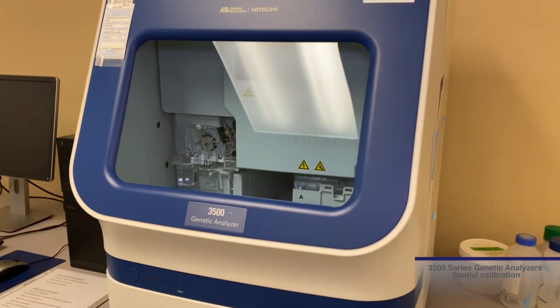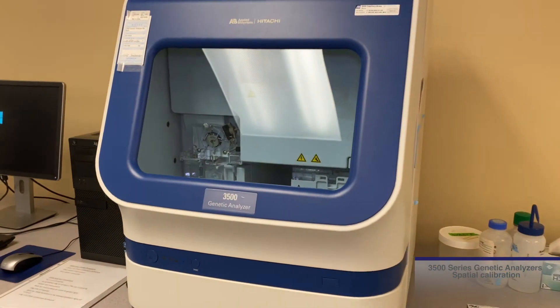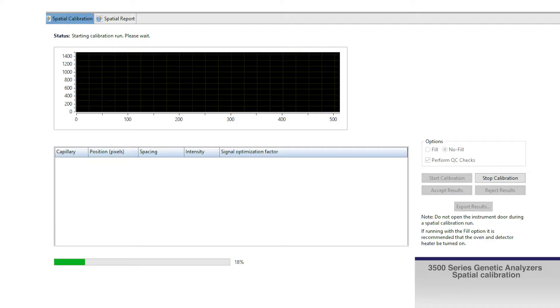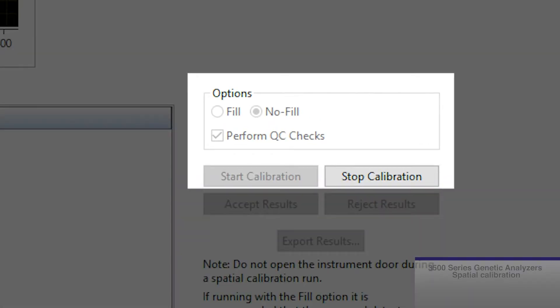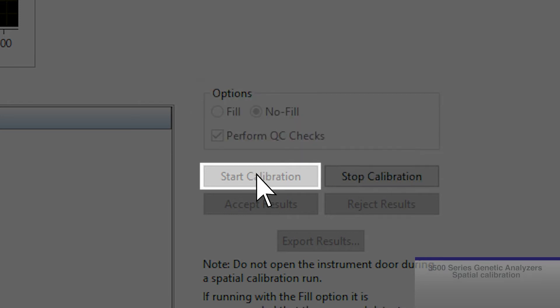The instrument has been moved. You can select the fill or no-fill option when starting the spatial calibration. Since the array was just flushed with polymer, select the no-fill option and click start calibration.